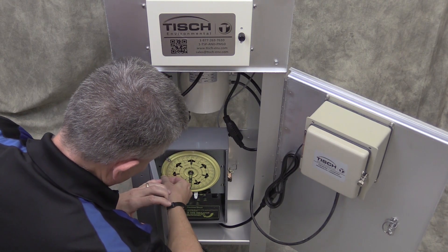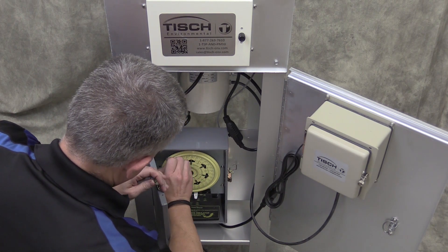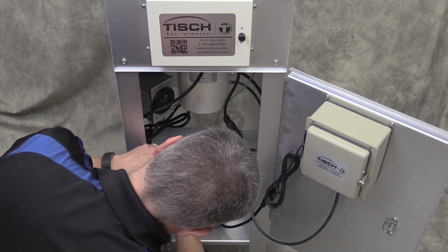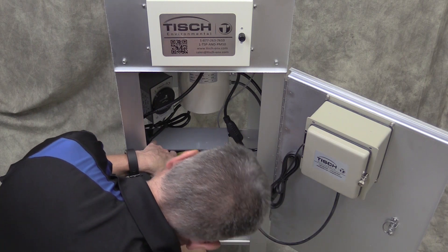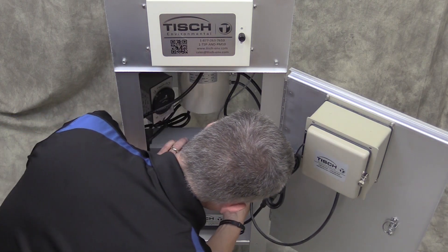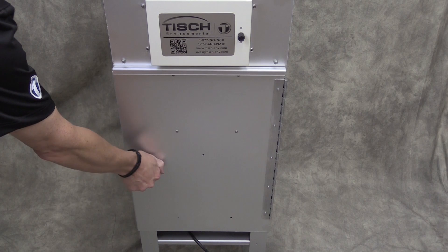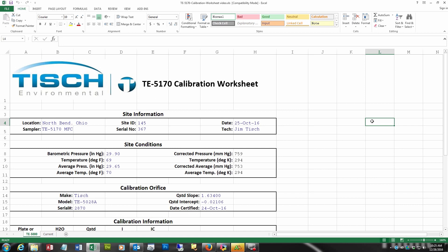Now you will need to set the timer to your next run. Remove the on and the off trippers and put them on your next run date. The on tripper goes when you want it to come on and the off tripper goes when you want it to go off. Normally it's 24 hours. Close the timer door. Now you should be ready to run your next run.